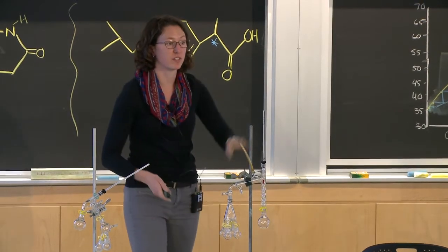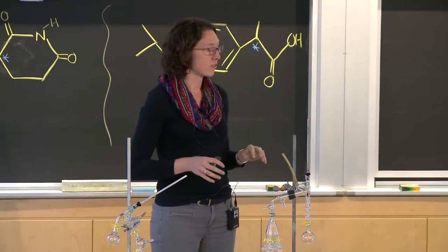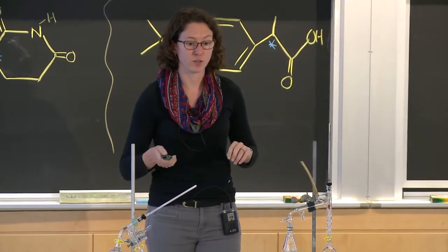mixture that you're given. So some of you guys will start with the caraway oil, some of you will start with the spearmint oil, and then you will both end up with limonene and carvone. It'll just depend on which isomer of the carvone that you have.